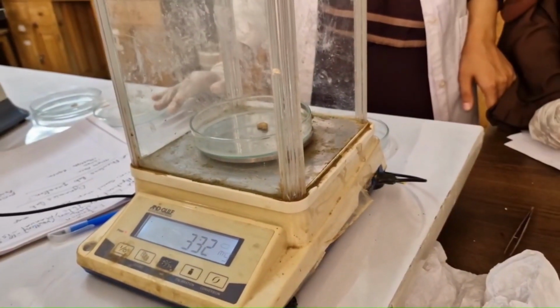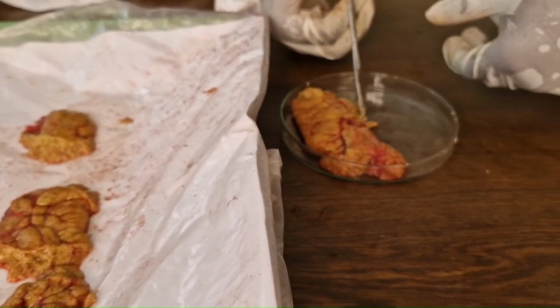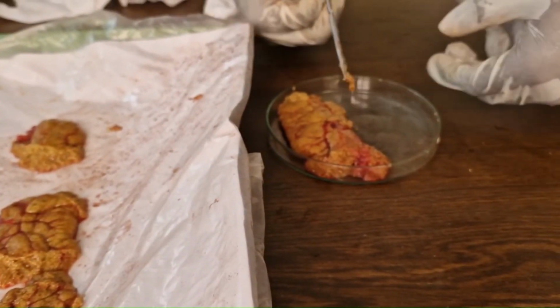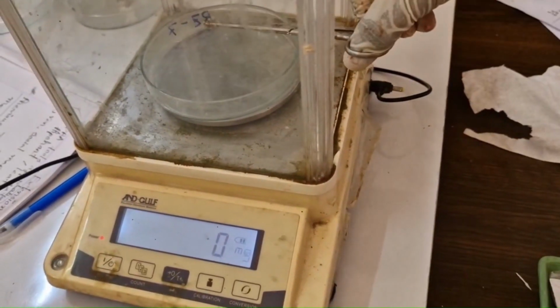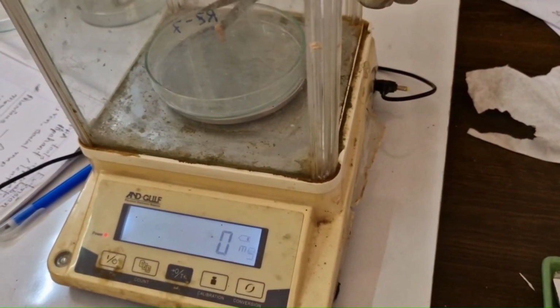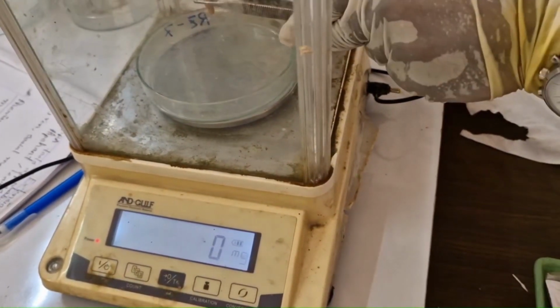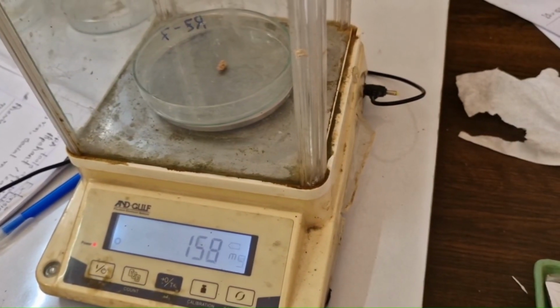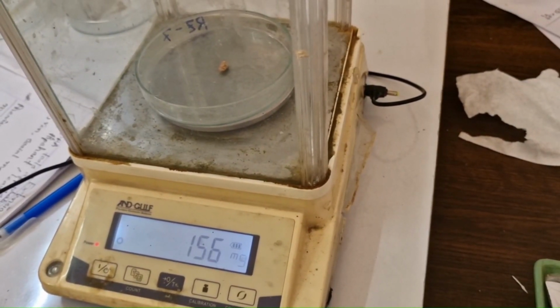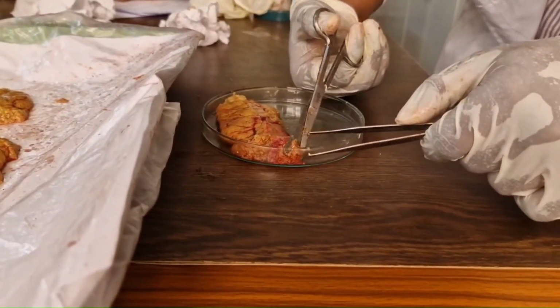F5 subsample weighed 156 milligram. And F6 subsample weighed 157 milligram.